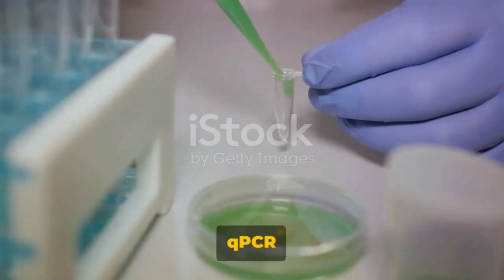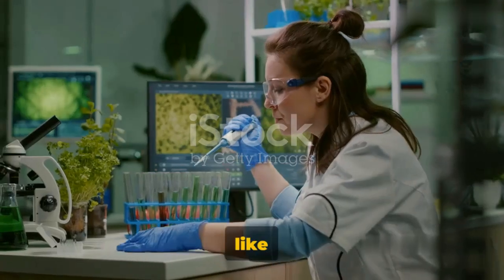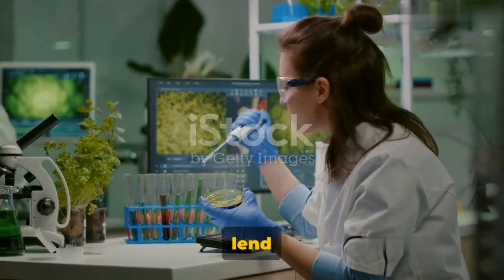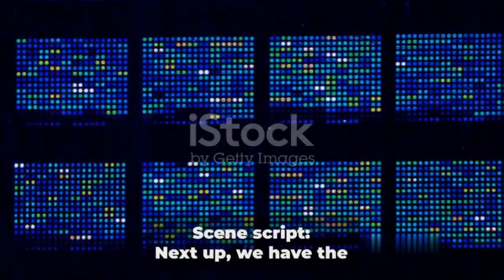Despite these nuances, qPCR is a quick and efficient method for measuring gene expression. It's like a reliable friend, always there to lend a helping hand when you need to navigate the intricate world of gene expression.